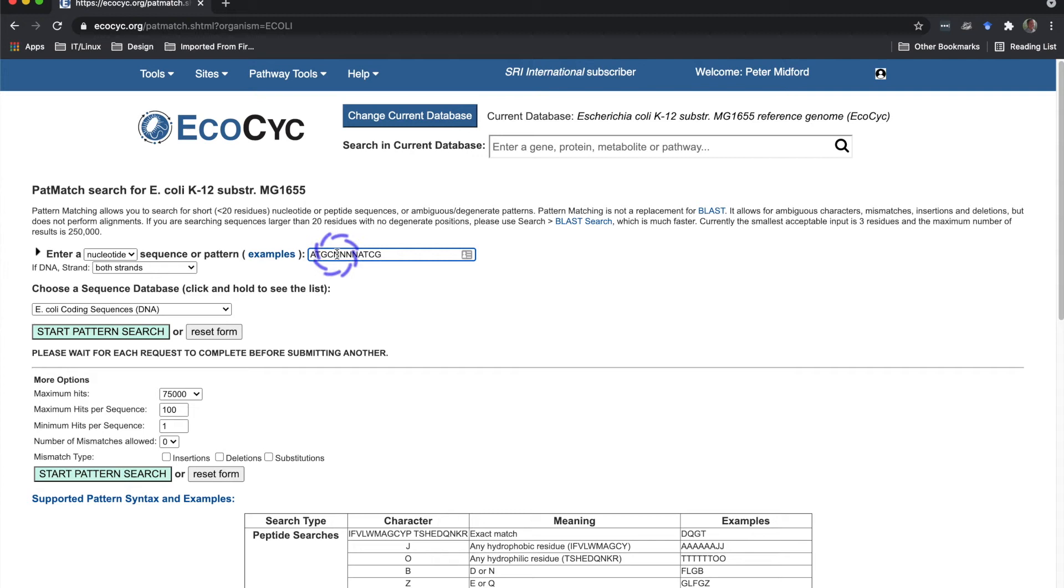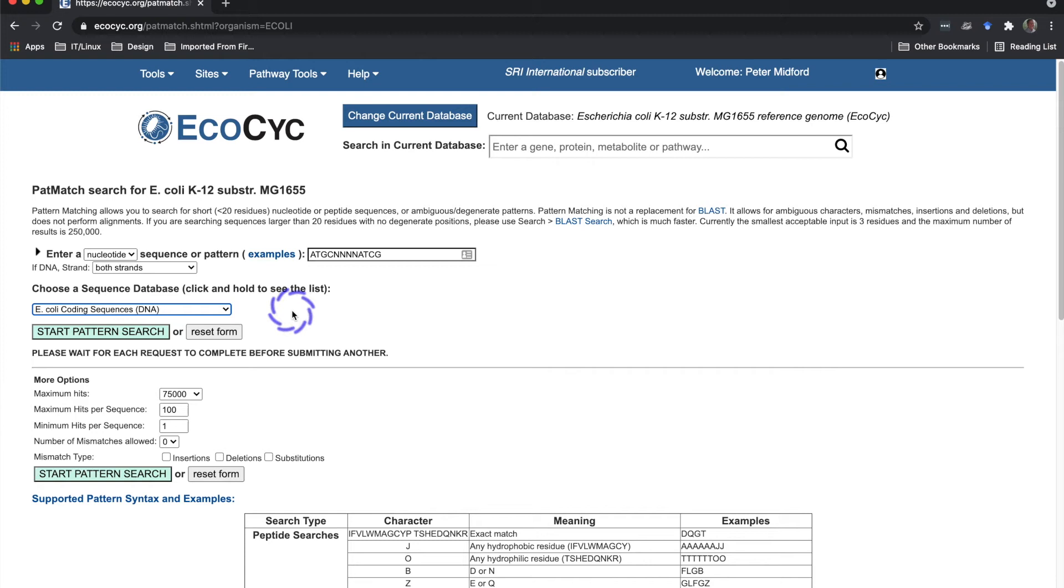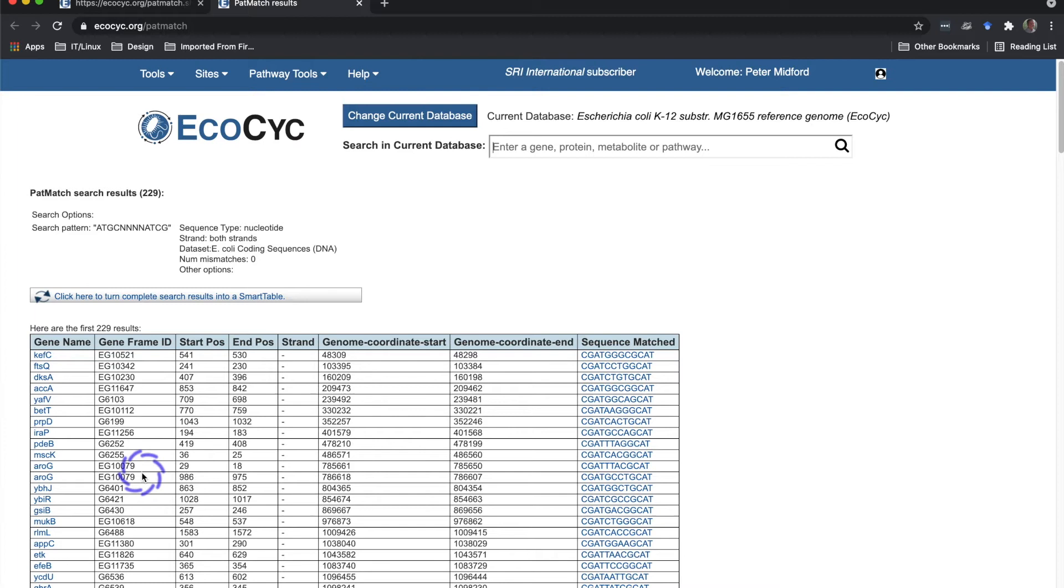I can search one or both strands and also define the scope of the search: the entire set of coding sequences, or the whole genome, or the intergenic regions, or against intragenic regions plus additional flanking sequences on each side. There are additional search options right here to limit the number of searches. But I'll run my search, and we get 229 results, and each result is described in this table. And if I click on a linked gene name, it will open the gene's page in a new browser tab.